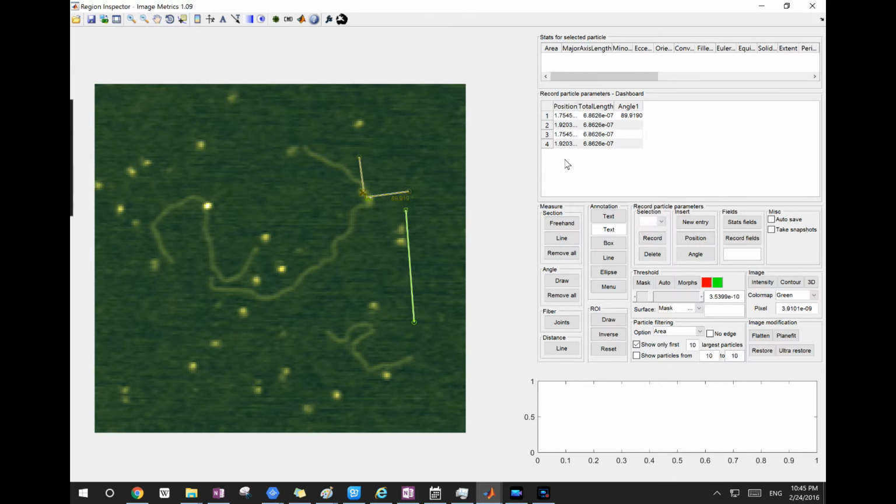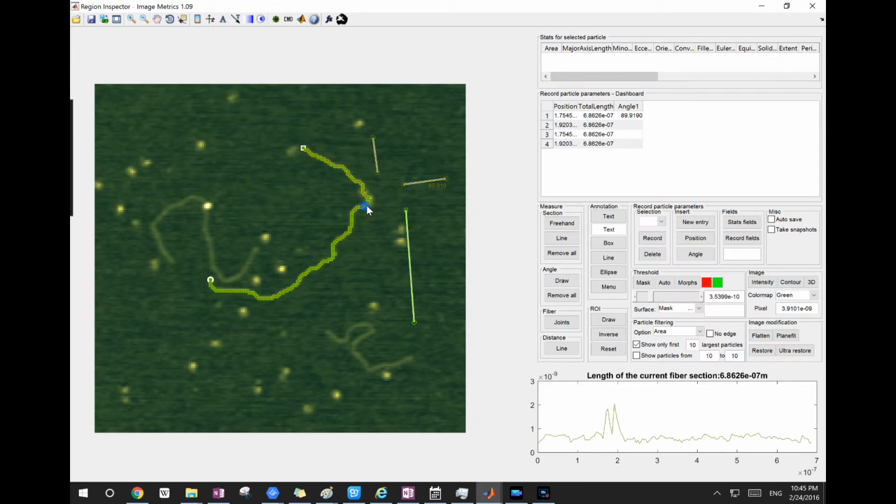and you can do the same thing for the particle too. One thing to keep in mind is when I click the particle, you see there are two markers there. There's a brown color and there's a green color. This color order is always the same. The first color is brown, the second color is green, and the third color is light green. So the markers will represent the same color as when you mark the peak. If you remember, there's a brown color marker in the first peak, and there's a green color marker in the second. So the color will give you an idea of what the order of the peak is.